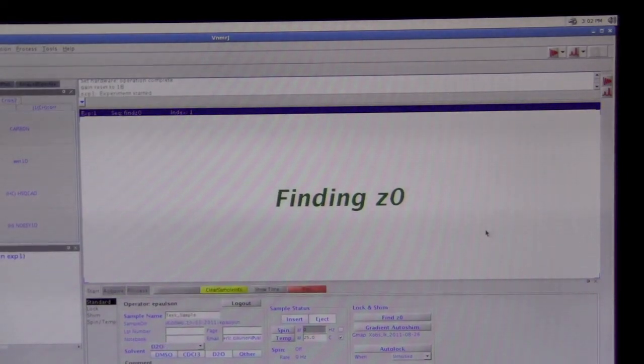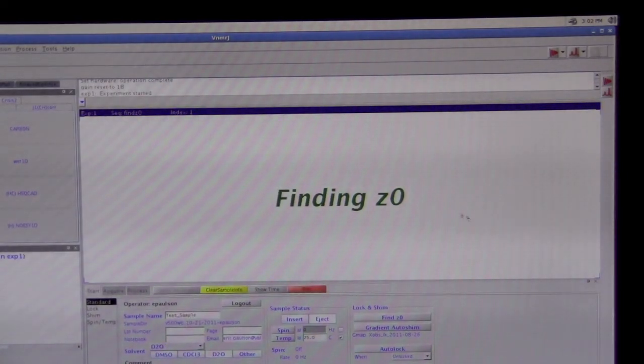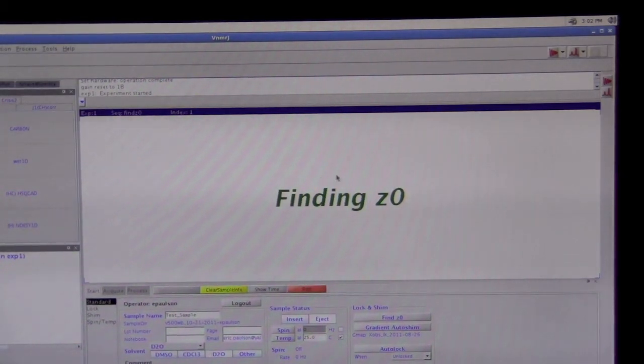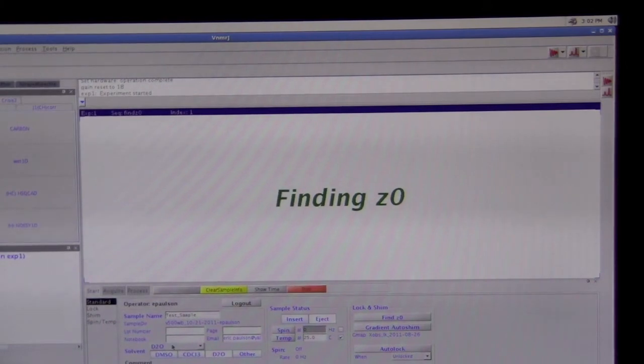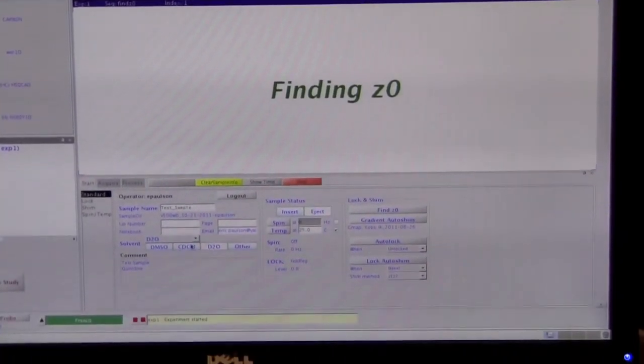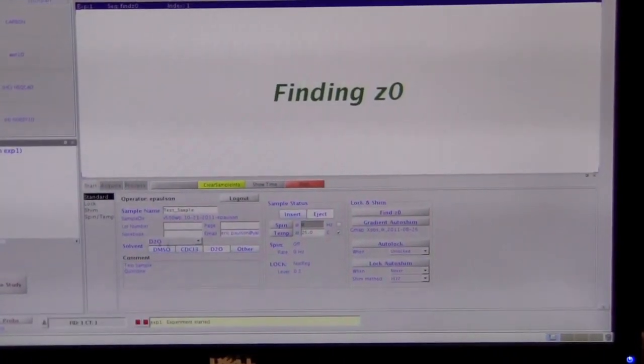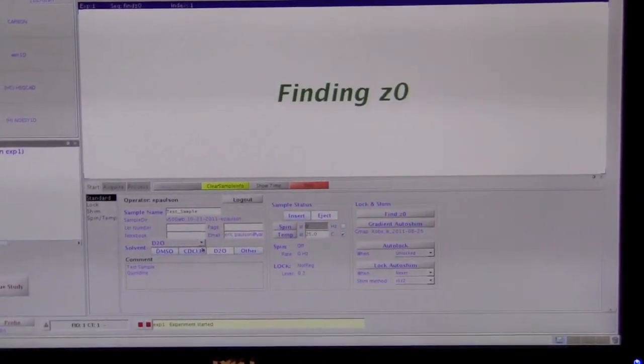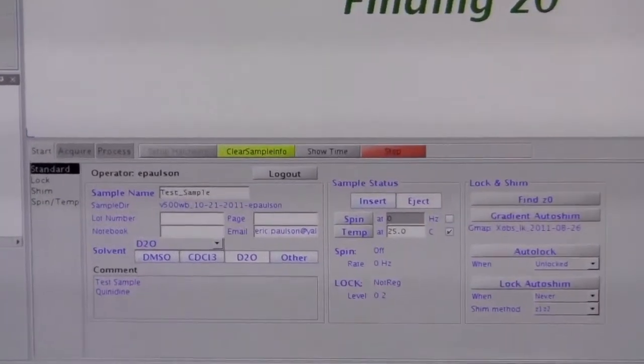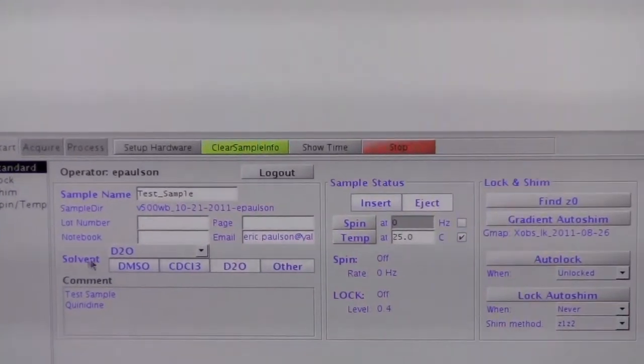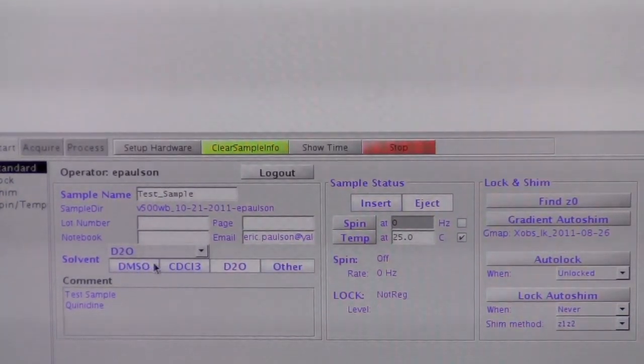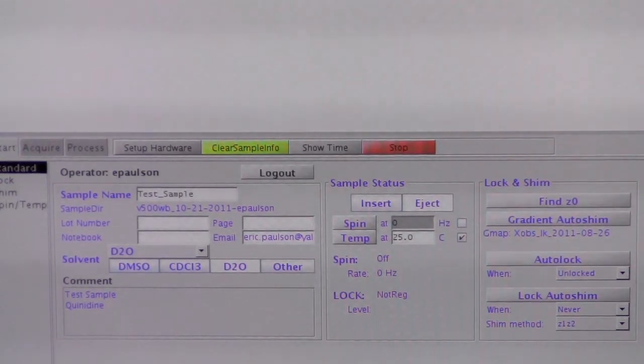When it finishes with the automatic lock, then it's going to do automatic shim because we chose that option. While it's doing the lock and the shim, don't worry about this solvent. If you put in the solvent correctly when you started, it will be correct. But when it's doing these other experiments, the solvent may be showing something different than what you put in. That's not an issue, so don't worry about it.